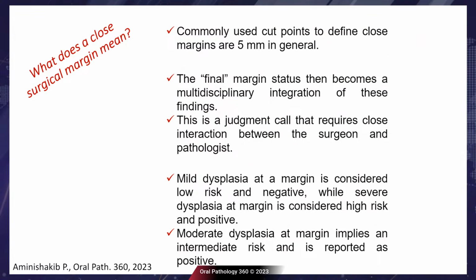Another important issue is what a close surgical margin means. Commonly, we use 5 millimeters in general to define a close margin, but the final margin is a multidisciplinary integration between surgeon, oncologist, and pathologist. I highly recommend you be in close interaction with your surgeon and oncologist to well define the close surgical margin. But 5 millimeters is considered as a cutoff for a close surgical margin.